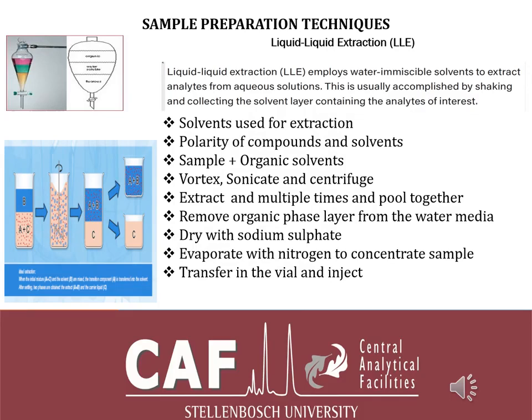Liquid extraction involves a water immiscible solvent like hexane or ether or dichloromethane or chloroform. That extracts the analytes from the aqueous solution, aqueous meaning mostly a watery medium, and then you shake and release the pressure. You shake, release the pressure, and then you can separate the layers.